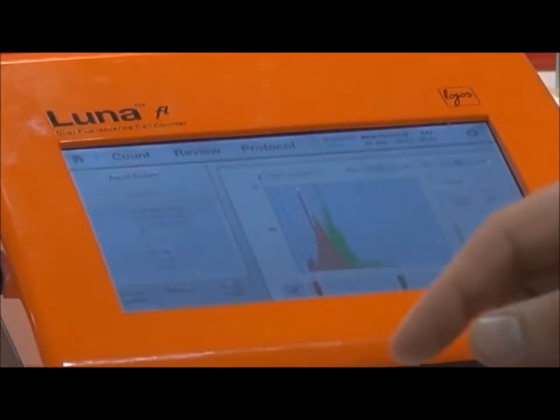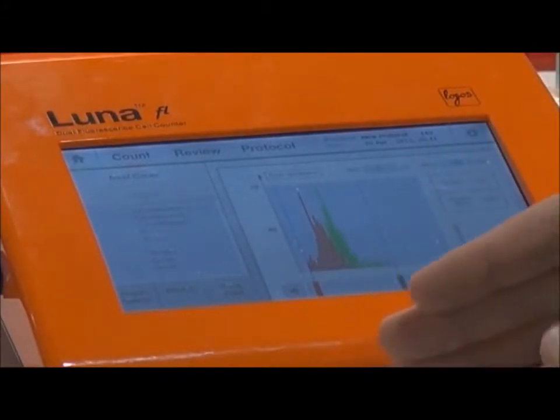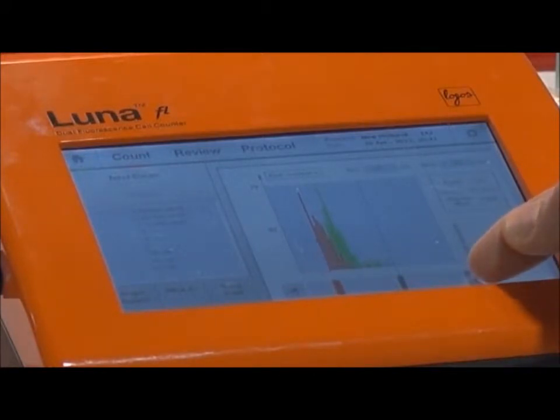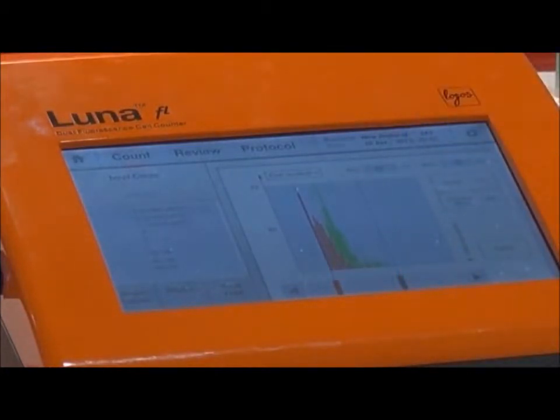For further analysis, you simply hit the graph, and it will display your data in a convenient histogram. You can furthermore analyze the data by toggling the gating function to hone in on a very specific region of your cells.